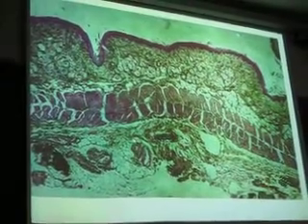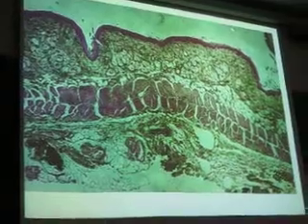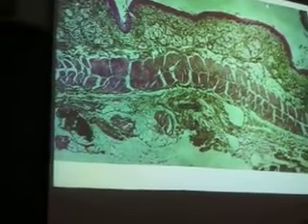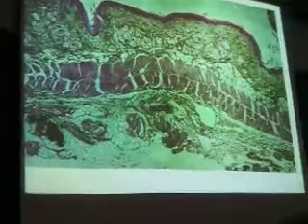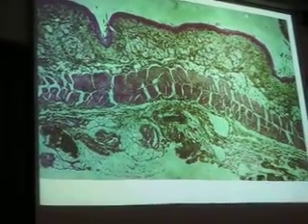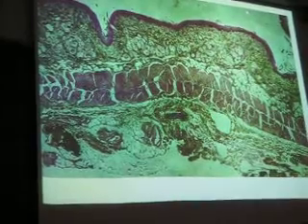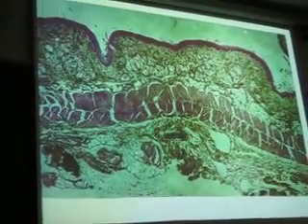All right, so where in the digestive tract are we looking? Use those identifiers that we were just talking about. Go from the lumen outwards. Stomach. So if one of those things isn't clear to you, try and back it up, or try and reinforce what you're thinking with one of those other layers.